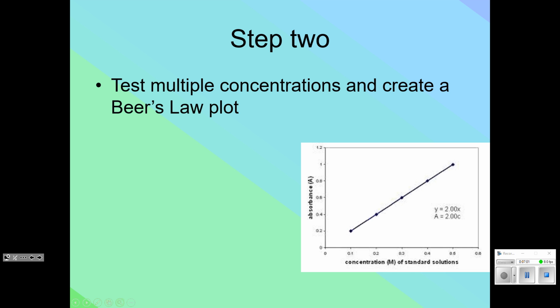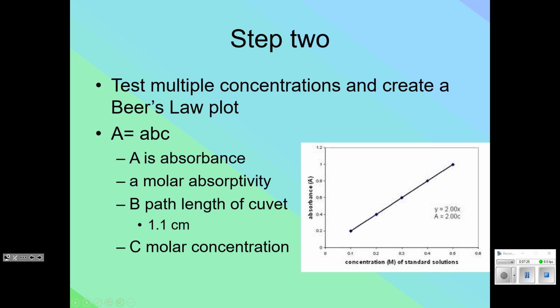Next class, we're going to use graphical analysis on our Chromebooks. We can use Google Sheets, set up our data, and create a graph like this. If you create a line graph and then measure the absorbance of an unknown, you can figure out what the molarity is.